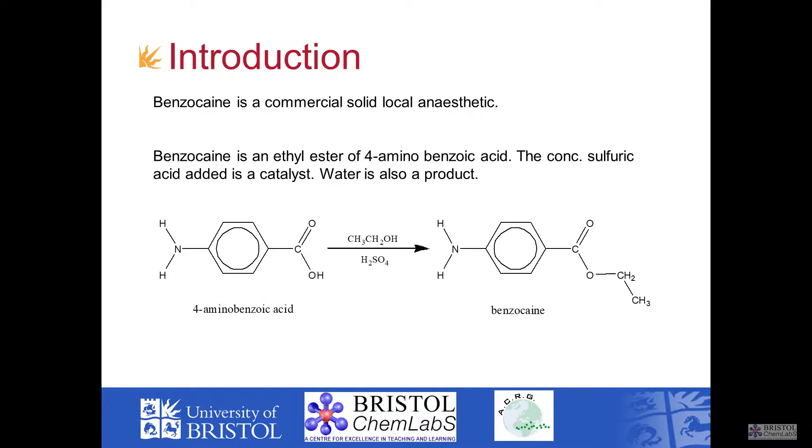In this experiment we're going to synthesize benzocaine, a solid anesthetic. Benzocaine is an ester made by the esterification of 4-aminobenzoic acid with ethanol using concentrated sulfuric acid as a catalyst.